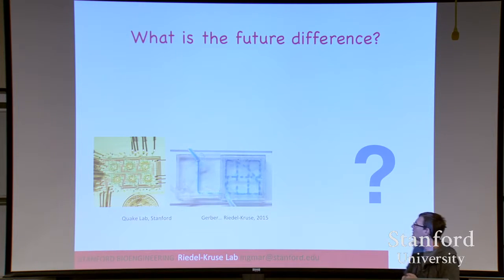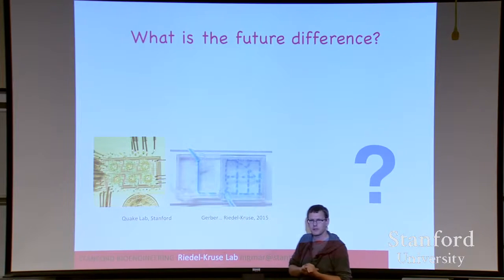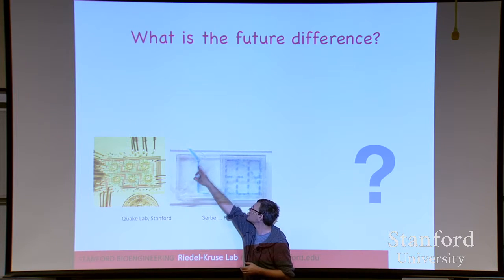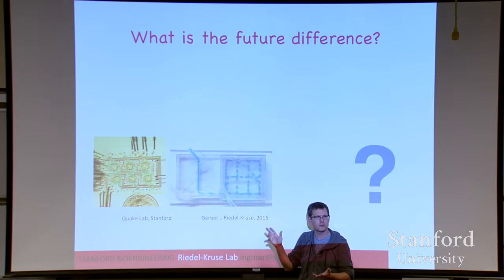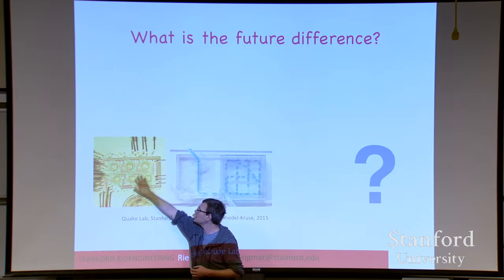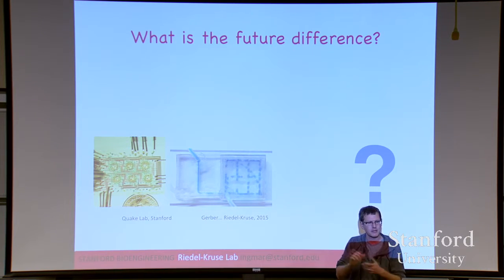Just to make this a little bit specific, what you see here are two versions of a so-called microfluidic device as an example. On the simple one, you see basically two inlets, the white and the blue fluid, and they merge and you see how droplets form and move around. And much more complicated versions you see here, which is like an integrated electronic circuit, but instead of moving electrons around, you move small fluid volumes.